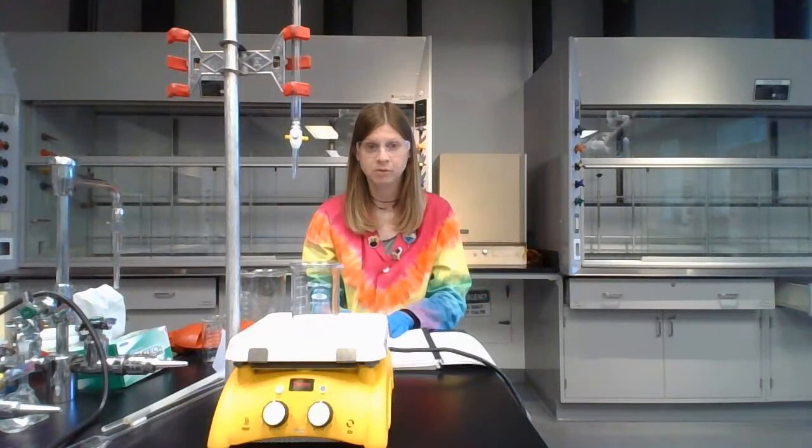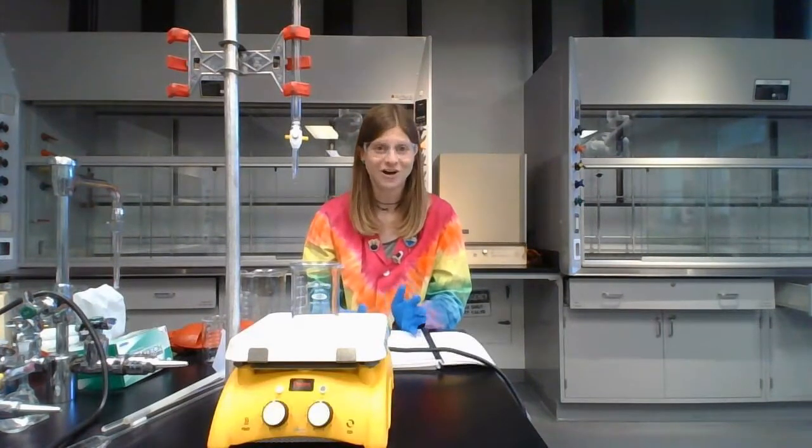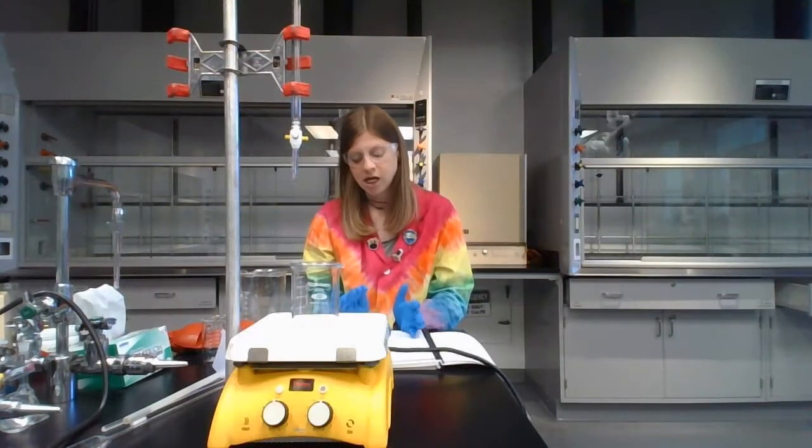So let's talk about part B, which is when we actually start the experiment. You're going to be doing a titration. It's going to be very similar to the NaOH KHP titration lab. The differences are it's a redox titration instead of an acid-base titration, and the chemicals we're working with are significantly more hazardous.